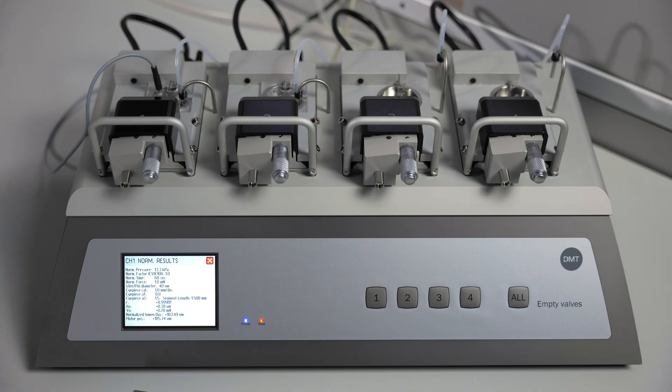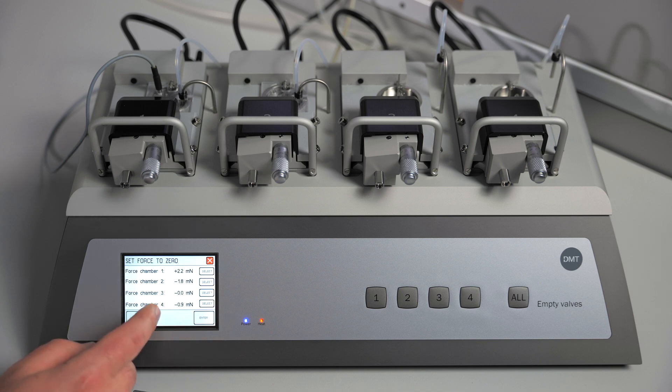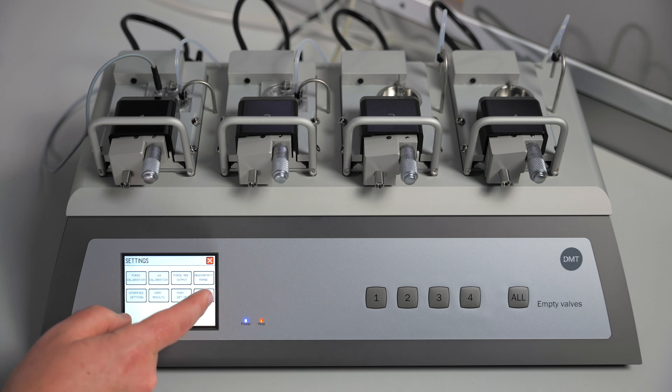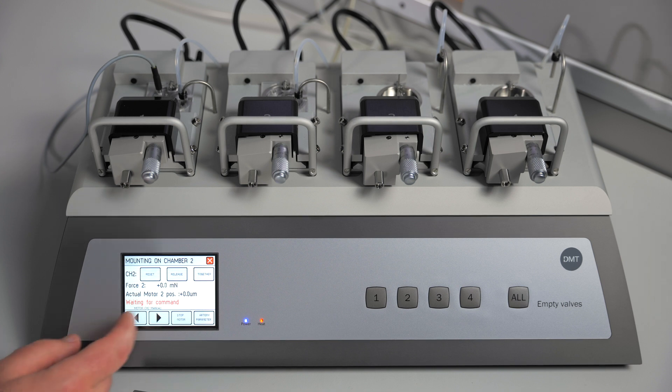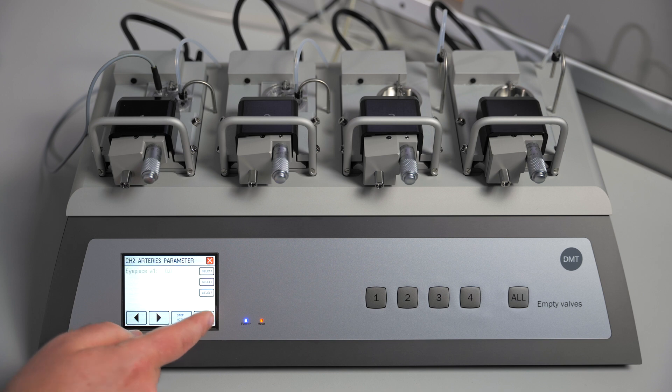Once the normalization completes you will see a screen with various parameters about that particular channel's normalization. You can exit out of this, then zero channel 2 and go into the mounting artery setup for channel 2. Press together and then reset. Go into artery parameters and set the length of this tissue — in this case this vessel was 1.8.